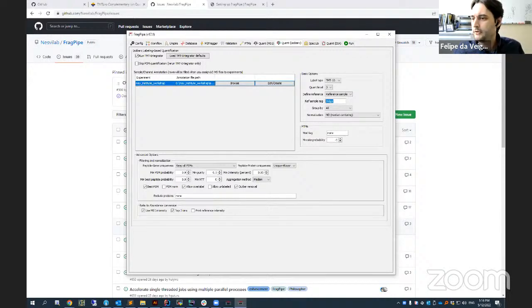In Alex's talk, he mentioned that the final step of the TMT workflow converts back to absolute abundances. Can you explain what that means? For the calculations, the TMT integrator uses the reference channels, so it calculates a ratio of the abundances to the reference channel. So the final table will be a ratio value, and in one of these steps, which is optional, TMT integrator can convert back from a ratio value to an absolute value.